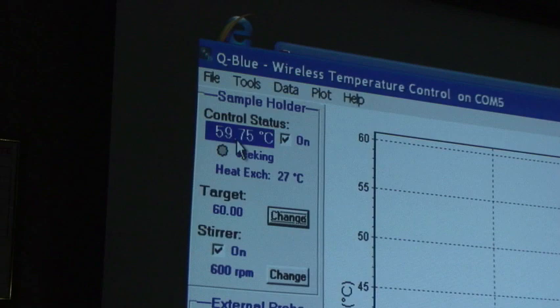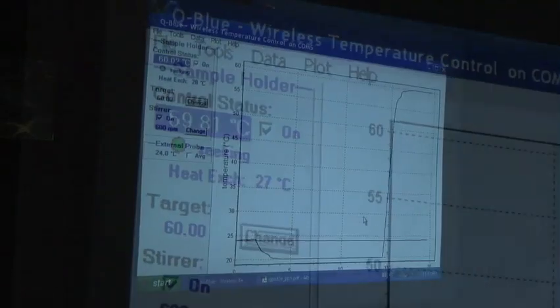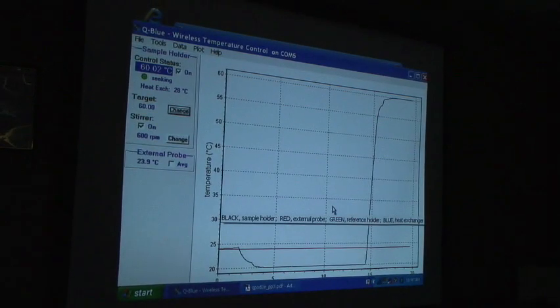The temperature now is not 60 degrees, but it's 59.8, which is pretty darn close — pretty much at 60. Let's set it down to 20 again.